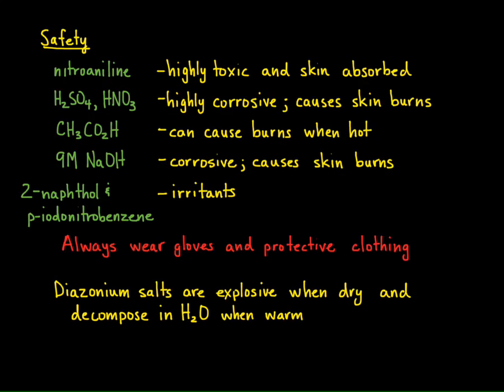You also need to be aware that diazonium salts are explosive when they're dry, and they decompose in water when they are warm to room temperature or higher. Make sure your diazonium salt solution that you will eventually prepare is maintained at cold temperatures.